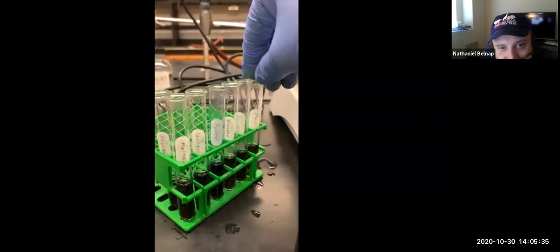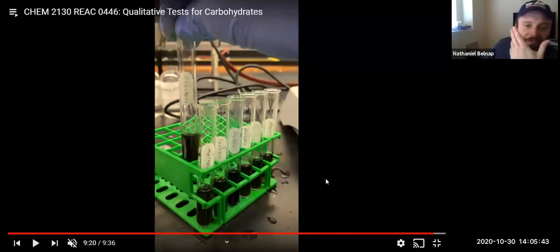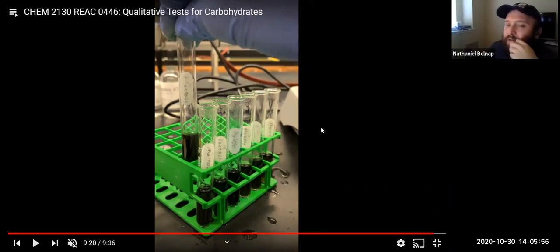Almost. So that looks like fructose. Looks like dark yellowish brown, right? Did you guys say so? Okay. So would that be positive? I don't think for this one you put positive or negative. I think it's just brown. I think for this one you just put the color.